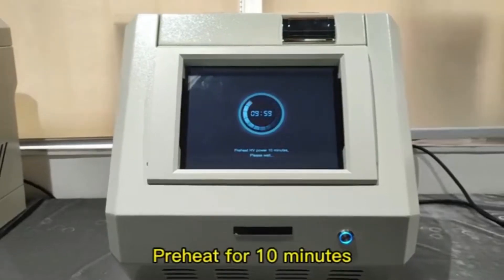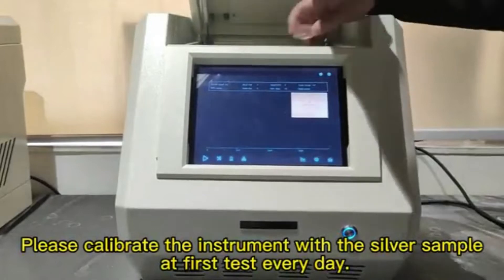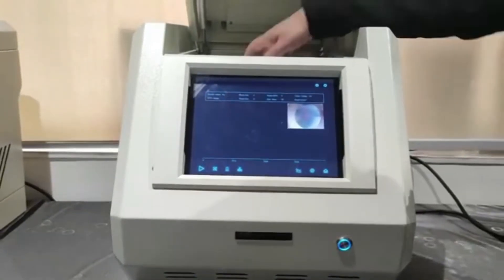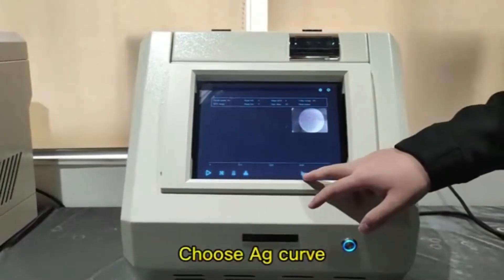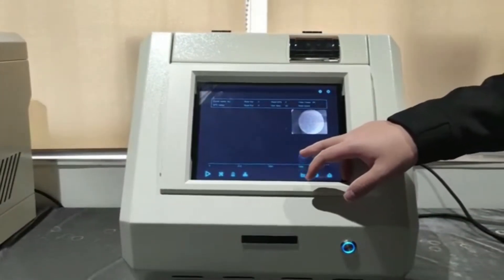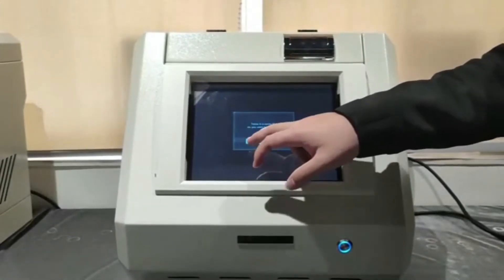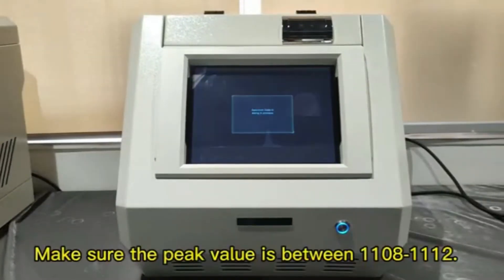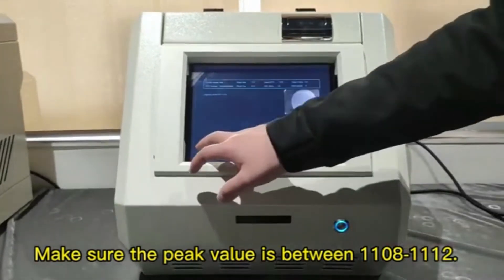Preheat for 10 minutes. Please calibrate the instrument with the silver sample at the first test every day. Choose a G-curve. Make sure the peak value is between 1108 to 1112.